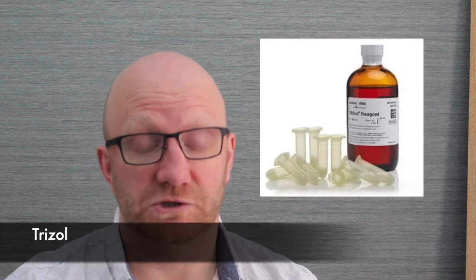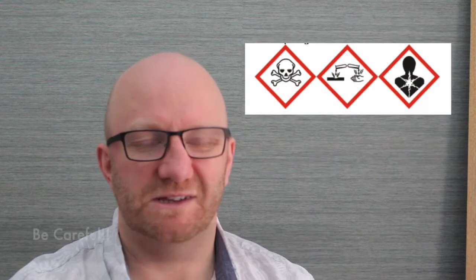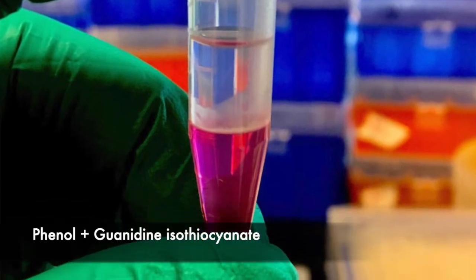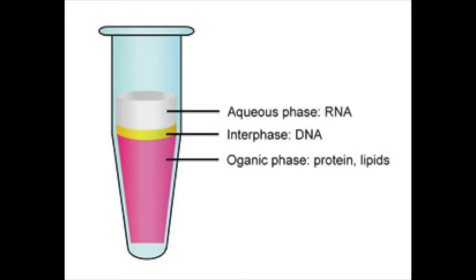The two most commonly used currently are probably Trizol and some sort of spin column kit. Trizol, or tri-reagent, is a pretty harsh chemical combination that basically bursts open cells and solubilizes just about everything in them. The tri in the name refers to the fact that different parts of the cells get separated into different fractions of the solution. The main components of the Trizol reagent are phenol and guanidine isothiocyanate. Trizol reagent allows you to perform sequential precipitation of RNA, DNA and proteins from a single sample.